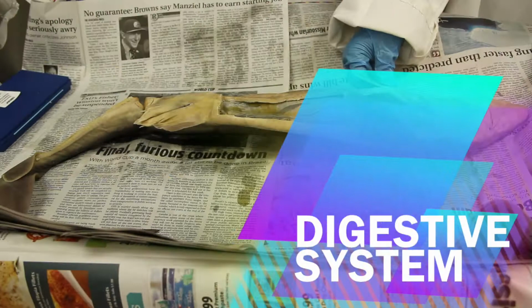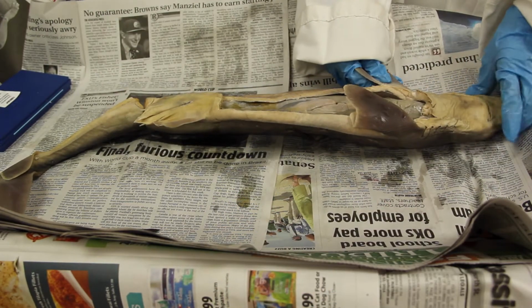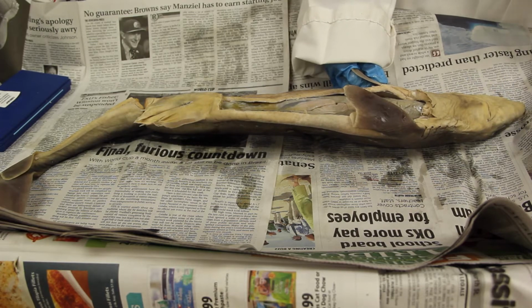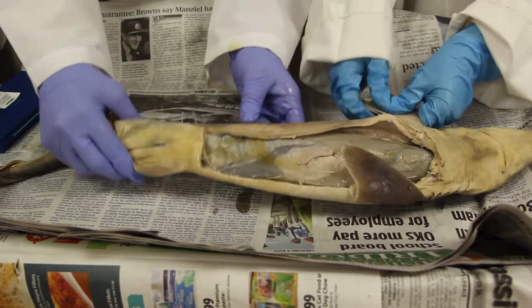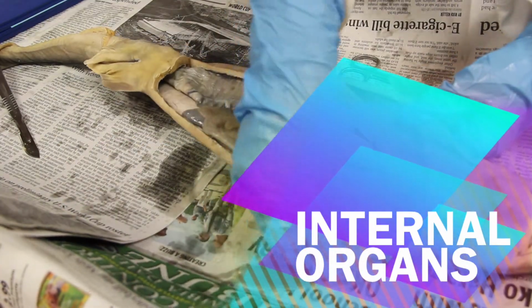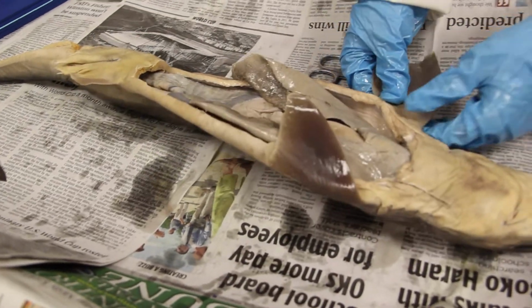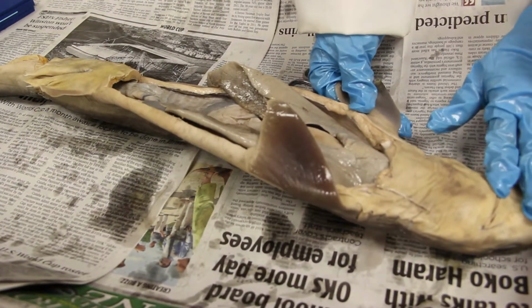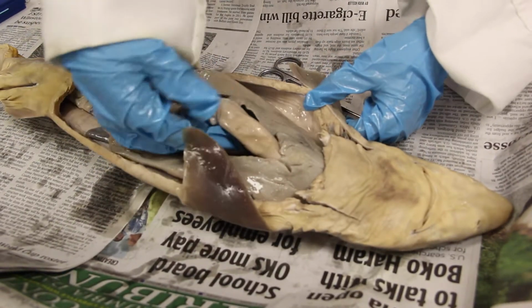So, the digestive system. The spiny dogfish shark primarily feeds on bony fishes such as herring and sand lance, but they can also eat other sharks, squid, and octopus. So now that we have the spiny dogfish's internal organs exposed, we're going to talk about the digestive system of this animal. Food goes in from the mouth and then to the pharynx, into the esophagus, and then into the stomach, which is this part right here.